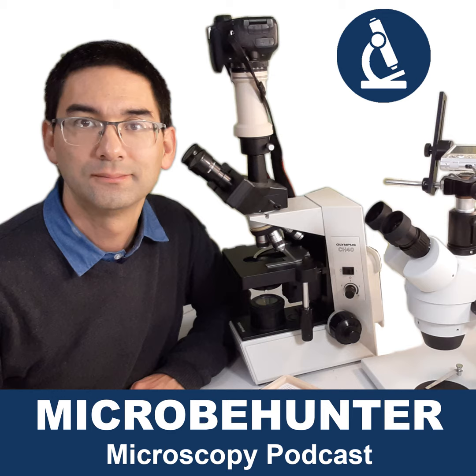For this reason, because we don't want this to happen in an educational setting, like in the school where I work, for example, we have removed all of the immersion oil and all of the mounting media, and we're not using these things at all. We're just using dry objectives.